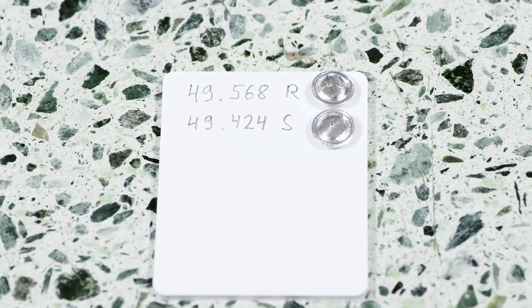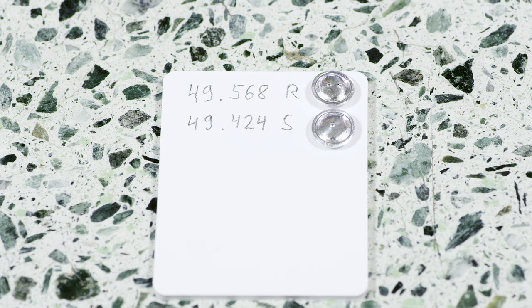The DSC calibration measurements are carried out with a reference and a sample crucible, each with a pierced lid. In order to achieve good measurement results, the crucible-lid combinations weight on the sample and reference side should not differ by more than 0.2 milligrams.